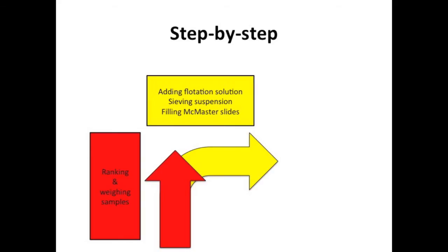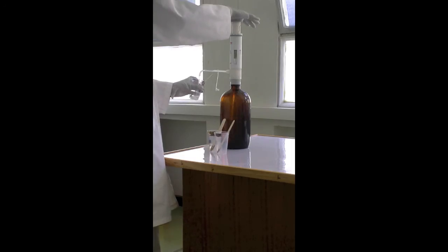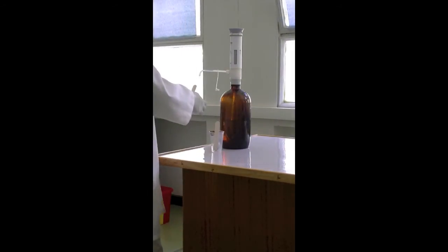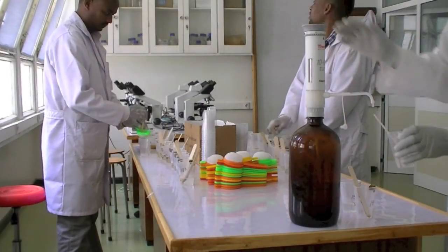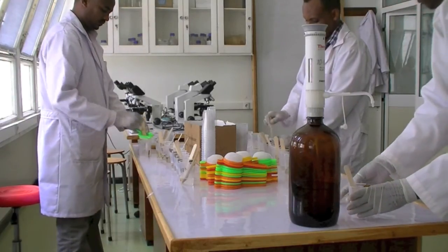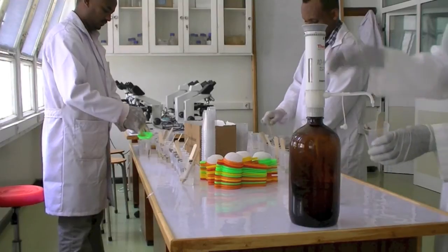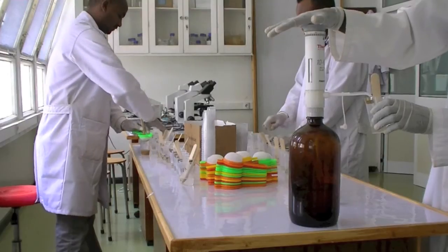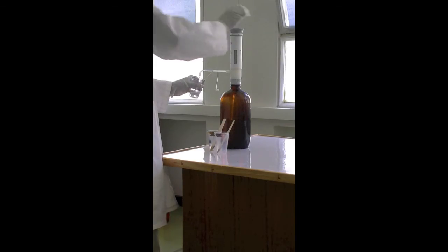Step 2: Adding flotation solution, sieving the suspension and filling the McMaster slides. At one side of the second table, flotation solution is added to the sample. The sample is then immediately brought to the opposite side of the table, where the suspension is sieved by two different people. Similar to the first step, the two people sieve the suspension in parallel. In this setup, we replace the measuring cylinder by a dispenser, which not only speeds up the process, but also increases the repeatability within and between laboratory technicians.